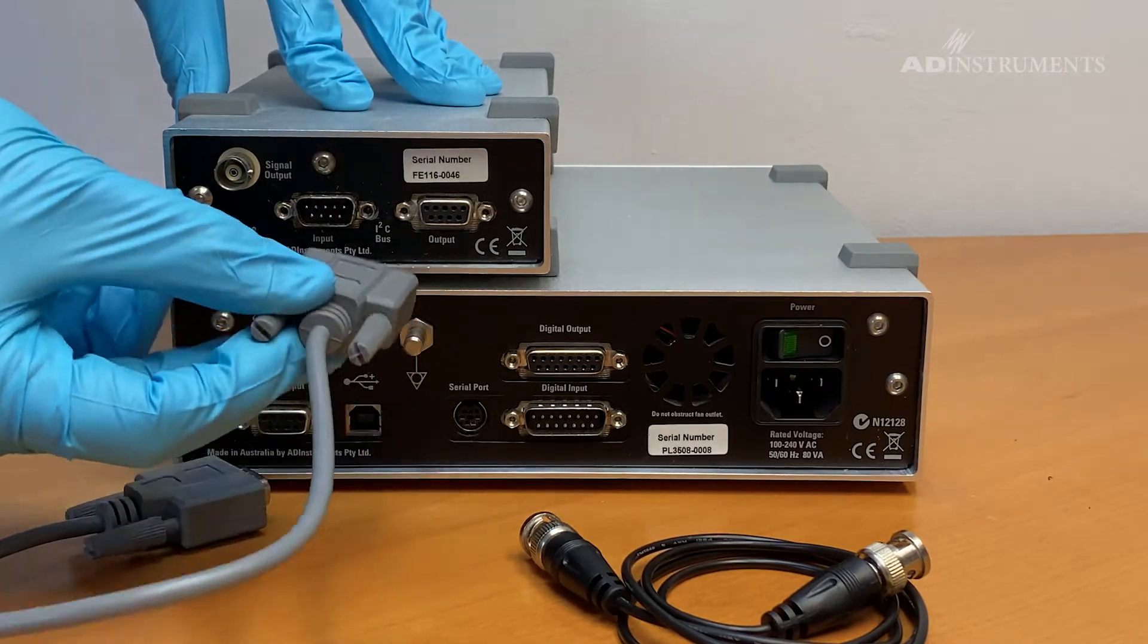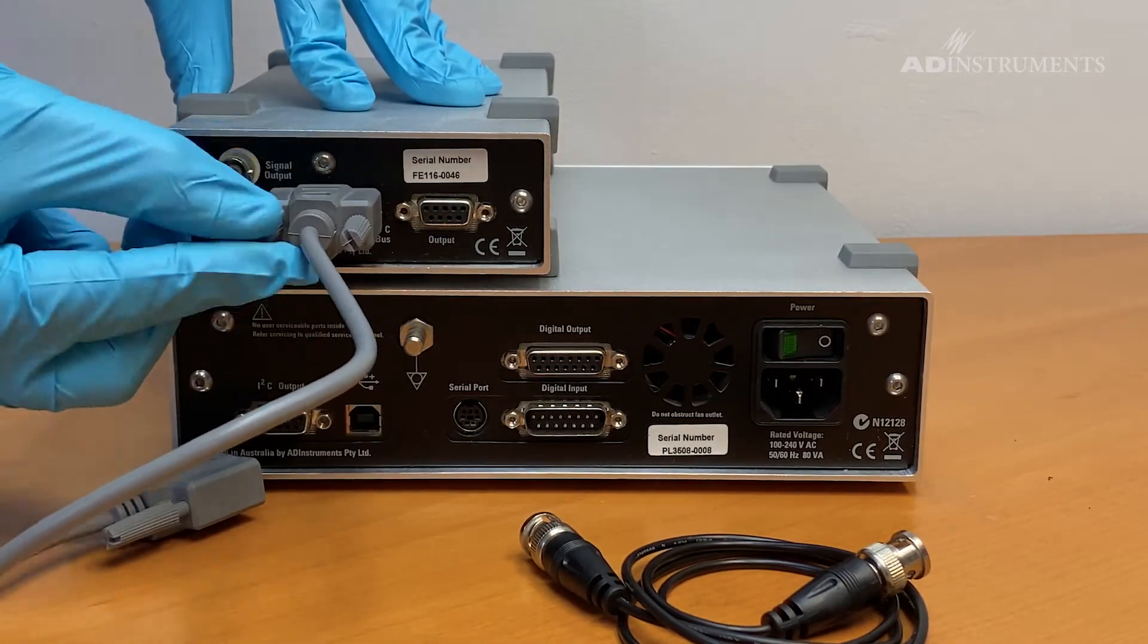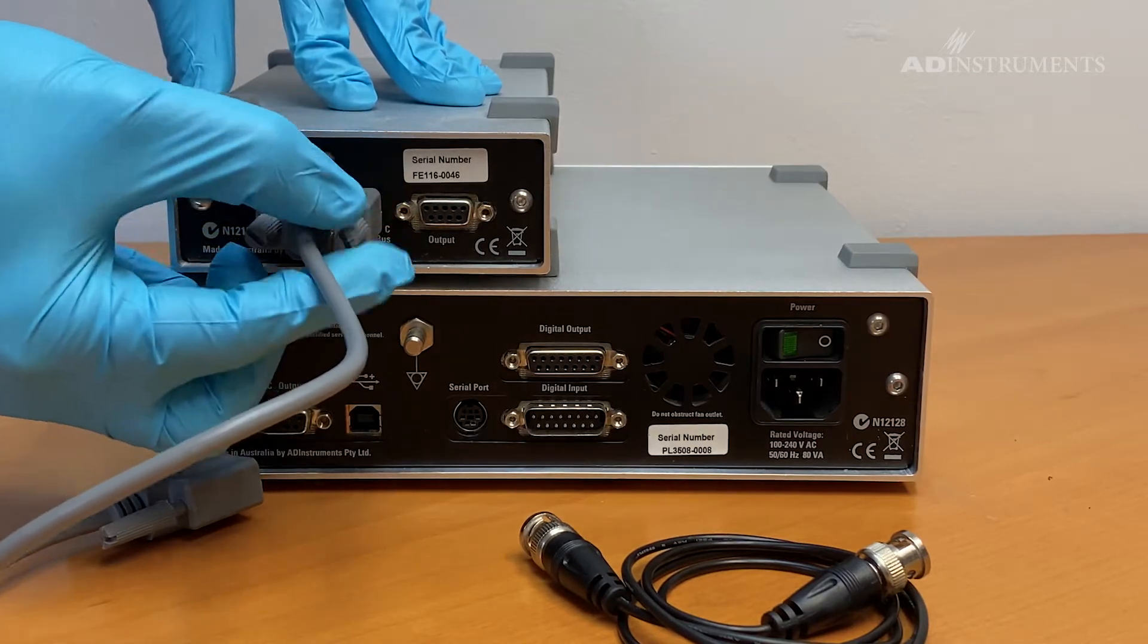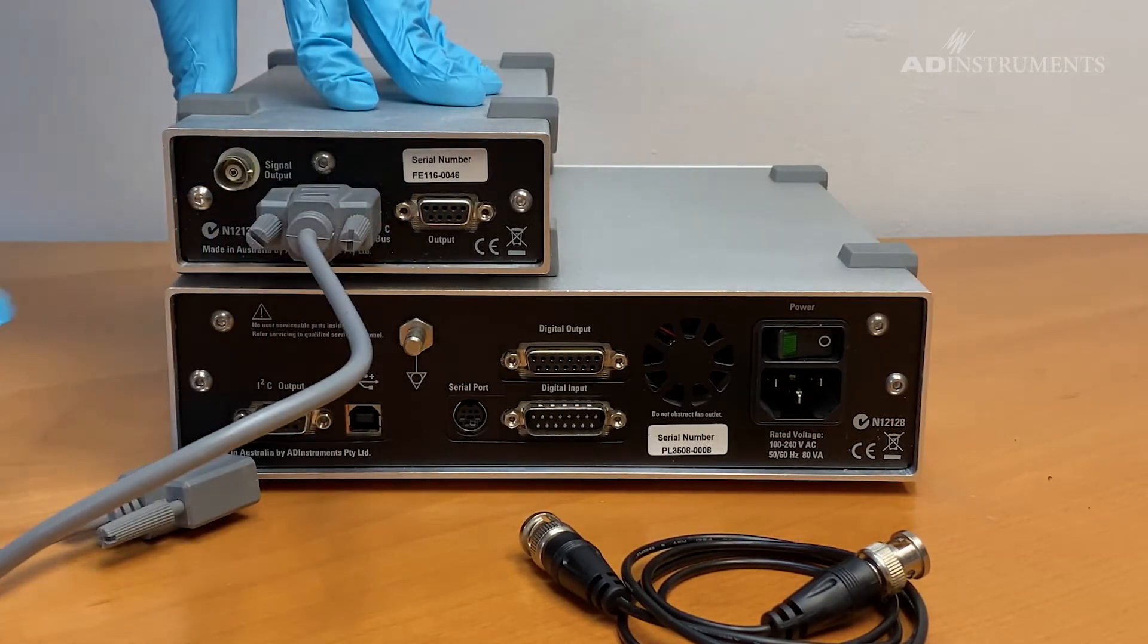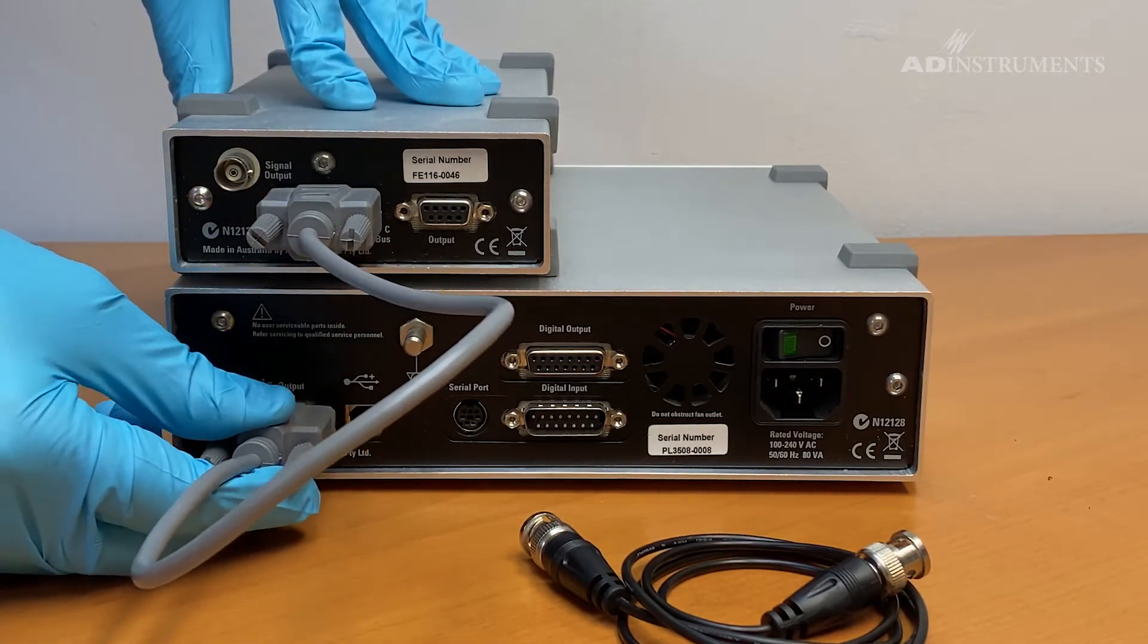Connect the I2C cable from the I2C input on the back of the GSR amp to the I2C output on the back of the PowerLab.